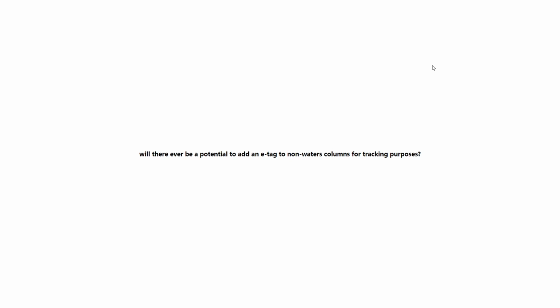All right, next question. How can we set up a sample set template that mandates analysts to enter column serial number before each time testing? So what you can do is you can make that column serial number, it's a custom field, you can make entry mandatory. All right, so when you create the custom field or if you modify the custom field, there is a tick box that you can check to make it a mandatory entry.